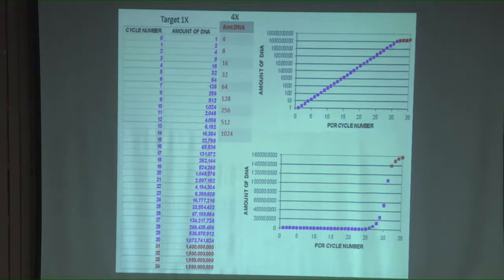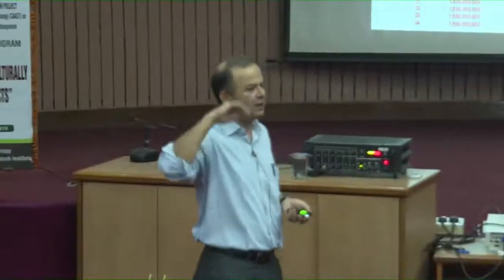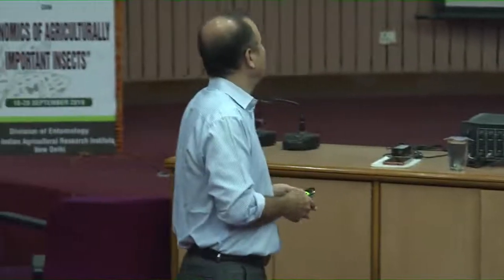Okay? So, you must have an idea within how many cycles I have to measure the product. Within how many cycles I have to measure the product. Sometimes we can do some preliminary experiment to see what the logarithmic phase is, and we try to do that.